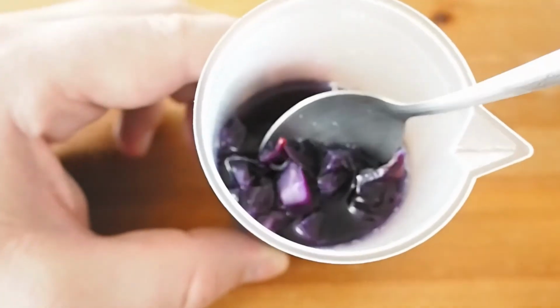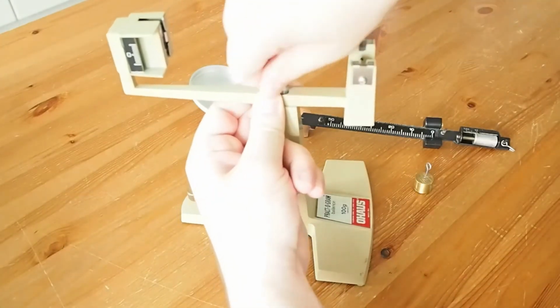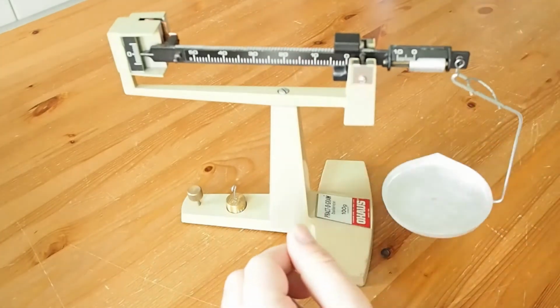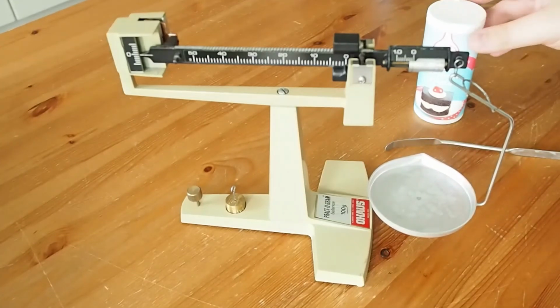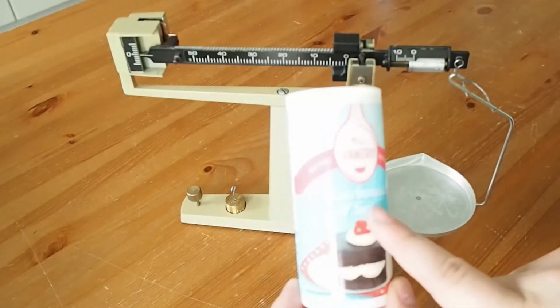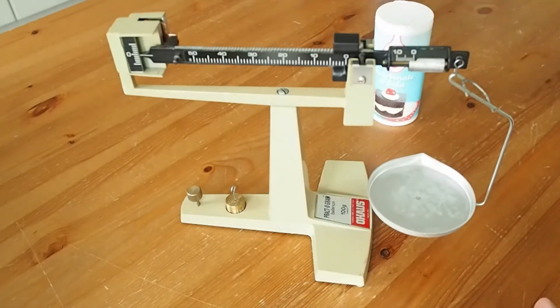So we need to make the red cabbage indicator, and I'll link that video. And then what we want to do is prepare a 0.5 molar stock of sodium bicarbonate, but I only want to make about 20 millilitres of that stock, so I'll need to dissolve 0.84 grams of sodium bicarbonate or bicarbonate of soda in 20 millilitres of water. So we'll weigh that out, and you'll need a spatula.